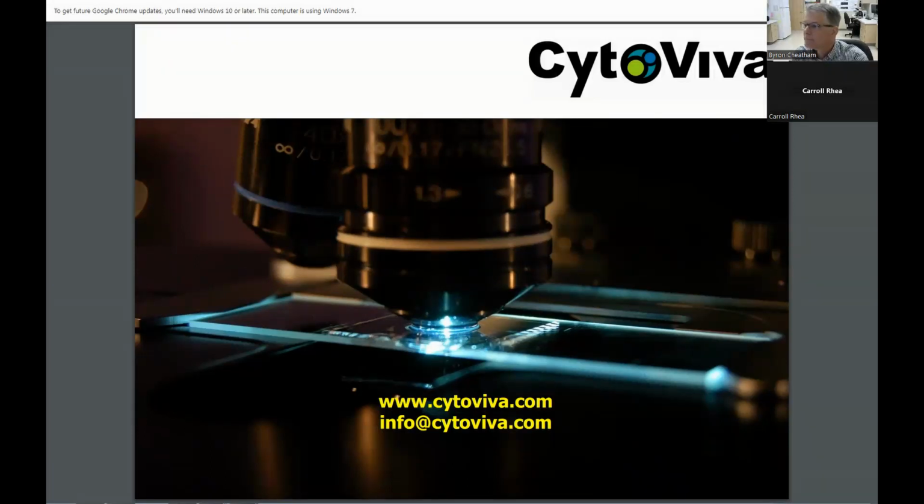All right. The next one is from Dimitrios. Good evening, Dr. Cheatham. Given that this microscopy measures scatter, what is the impact of the shape of the nanoparticles in the measurement results? Would deviations from the intended shape, for example, a sphere, create a noticeable change in the spectral images? The answer is absolutely yes.